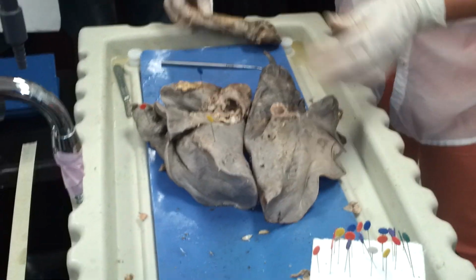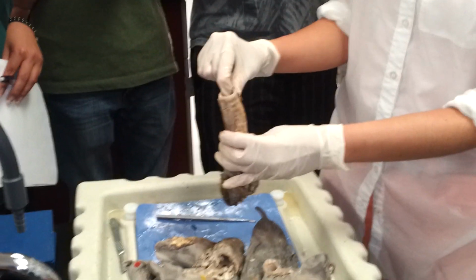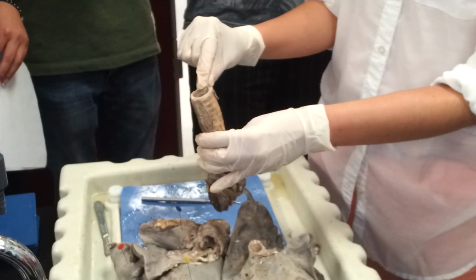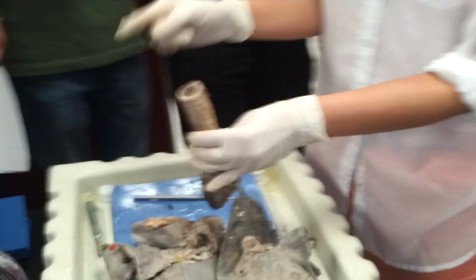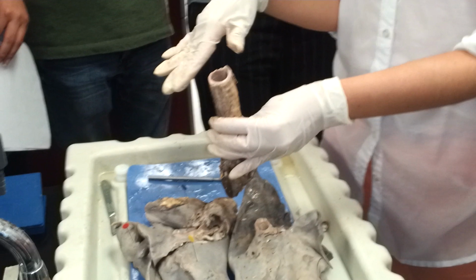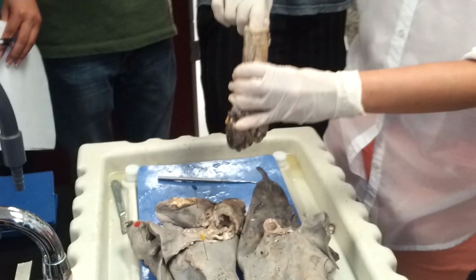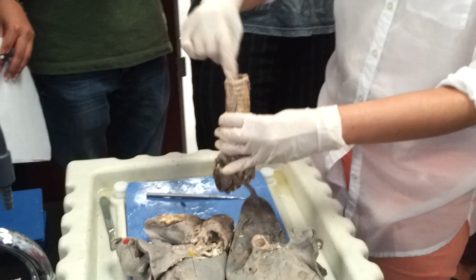Yeah, spongy. And then remember I said also that the trachea has what type of tissue? Pseudostratified, ciliated, columnar epithelial. Pseudostratified ciliated columnar epithelium. Right? So if you feel the inside of the trachea and you just kind of push against it, it feels really velvety. So if you guys want, you can do that. Because you can feel the cilia.